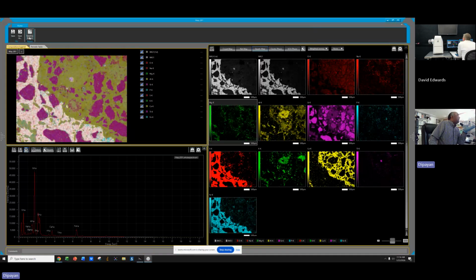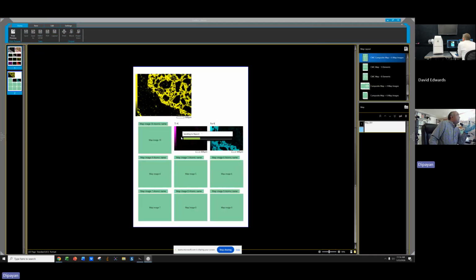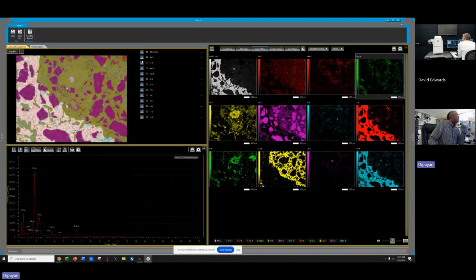See, in this case, okay, let's go to the report. And again, I have this, what happened? Oh, not that one. Okay, so what is my report? Here it is. See, this is how I get my 9 elements, and I don't need that one. I don't know why this one showed up here. Because you didn't turn it off yet. Oh, yeah, you are right. Here I have to get rid of it.